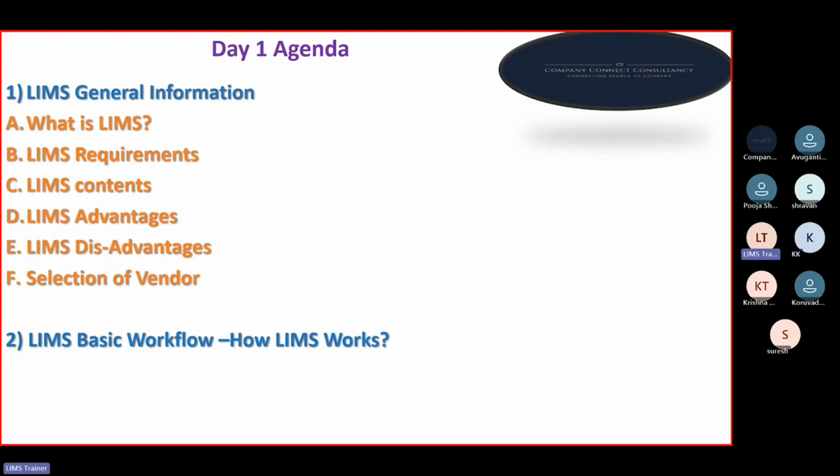Another scenario is if the LIMS software is already implemented at the client side, I can say in the laboratory, and they just require the support or the master data management for their company. Okay, so let's say there is a huge or big pharmaceutical company. They don't have their own team to create the master data.